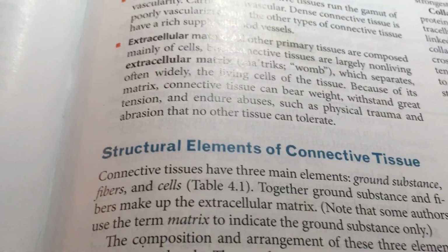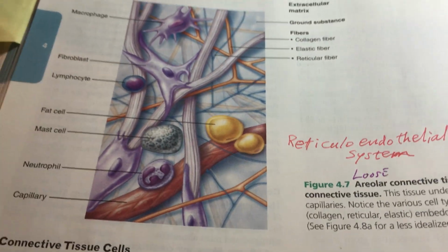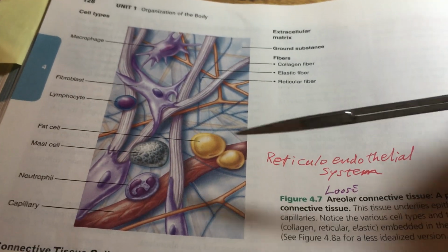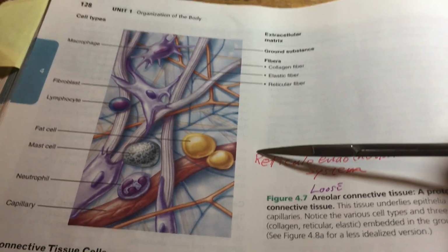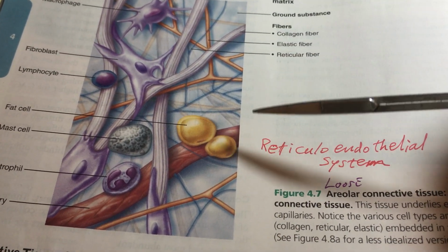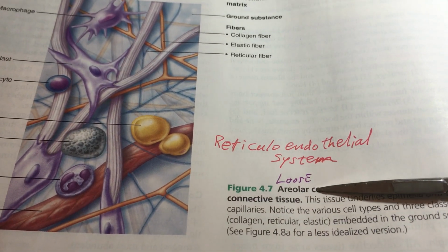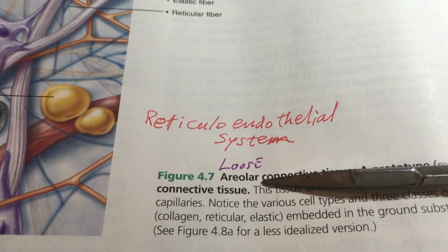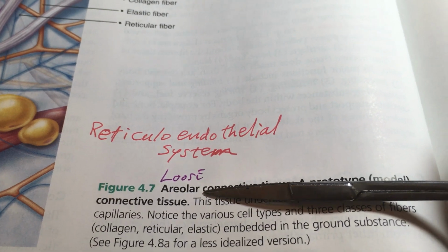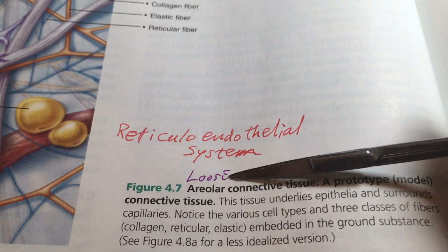Okay, so let's press on to the actual examples over here. They begin with this example, which is an artistic rendition of areolar tissue, and it begins with connective tissue proper, and it gives you some of the broad elements. Since this is an artistic rendition, we can observe, okay, this is loose connective tissue, also known as areolar. Some people actually say areolar. So you have your choice, areolar, or just simply loose CT. I tend to go with that expression.